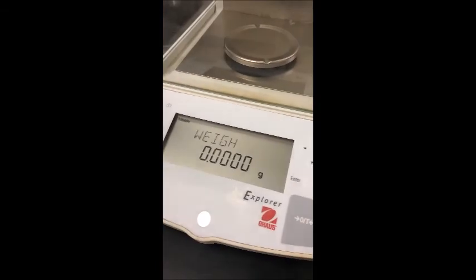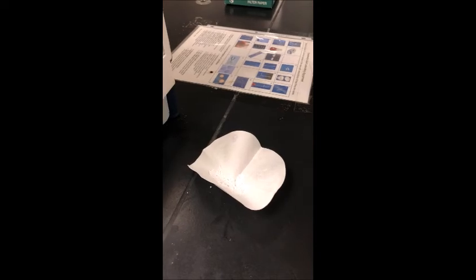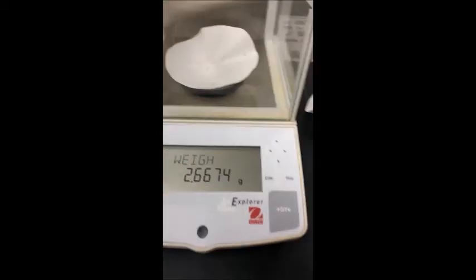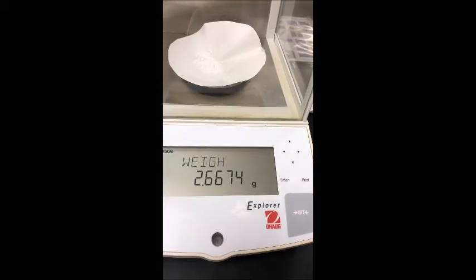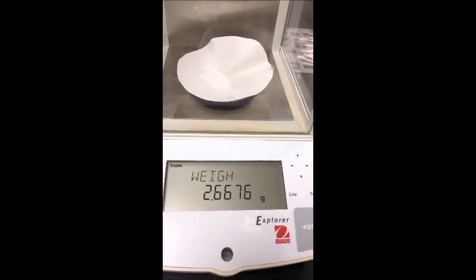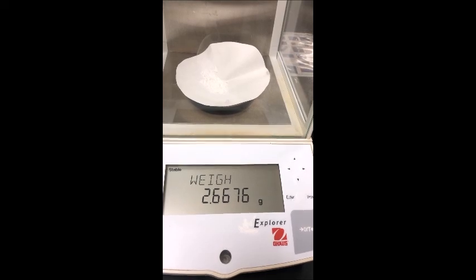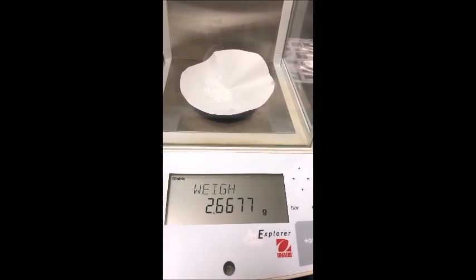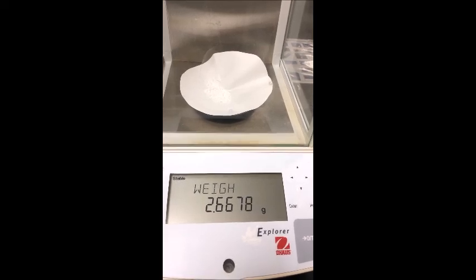Okay, so here, finding the mass of the filter paper plus the sample. Here's for sample A. We'll place it out here, find the mass. Okay, and then we will use that value to calculate our molar mass in the end. You'll need this value through some calculations to be able to figure that out.